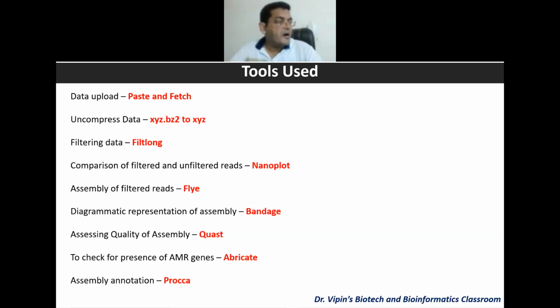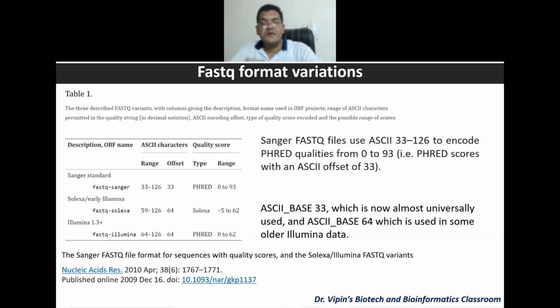And in this one hour, roughly, we'll have around 45 minutes now, so we will not have much time, but let's go forward. What I've done is I've taken screenshots of everything so that it is comfortable for you, and I've also given you the help link that you can use for going back and doing this again. But before moving forward, let's answer some of the questions that were asked yesterday.